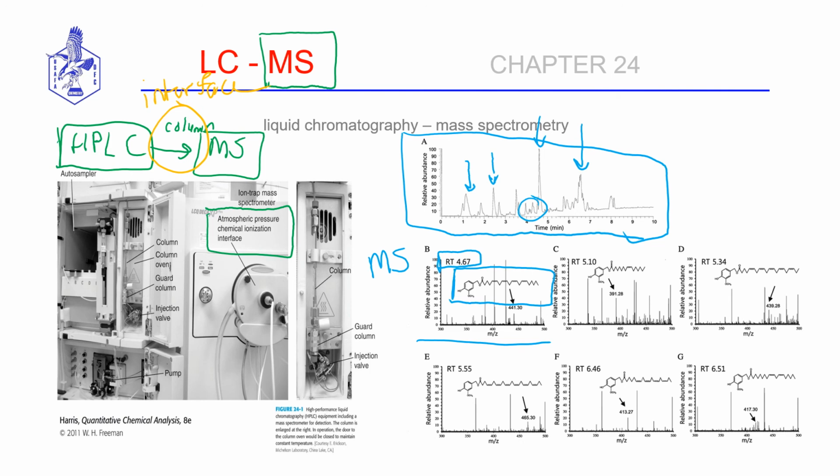and they are extremely powerful. So this ends our section on high-performance liquid chromatography, and we will give consideration to gas chromatography next and its advantages in application as opposed to LC.